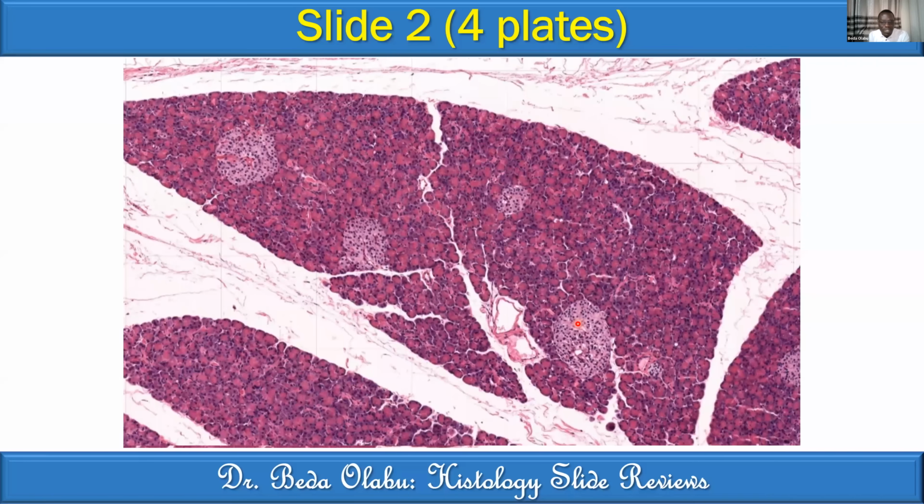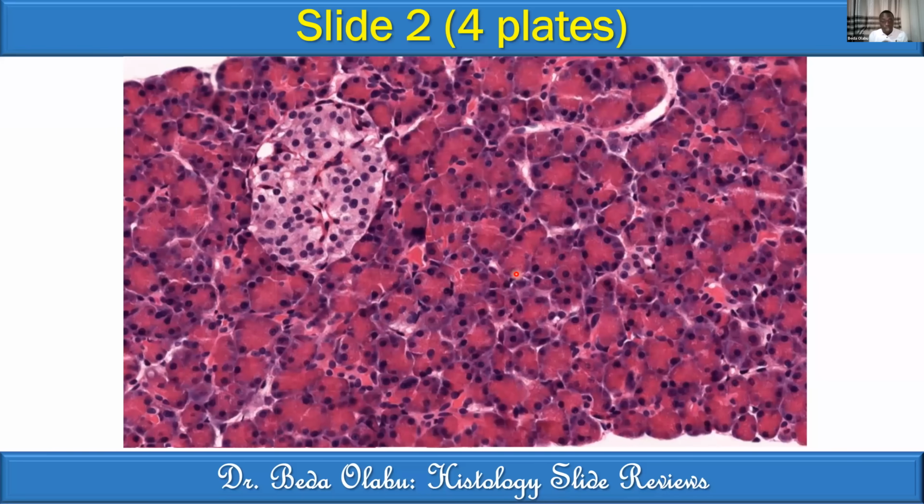These ones are not mucus acini. These are clusters of light staining cells. Look at them. The cells are numerous, grouped together. So the parenchyma has clusters of light staining cells. That stands out for this particular organ. And so a higher magnification confirms that we have a cluster of light staining cells.